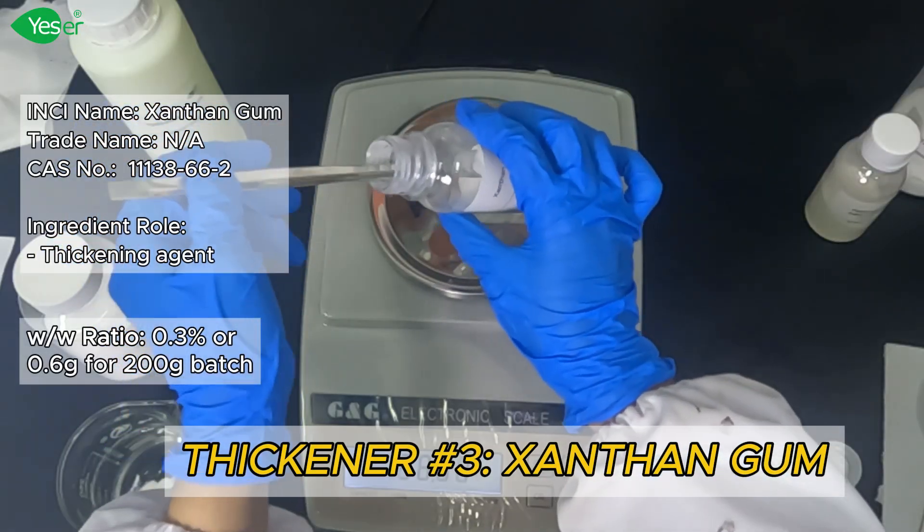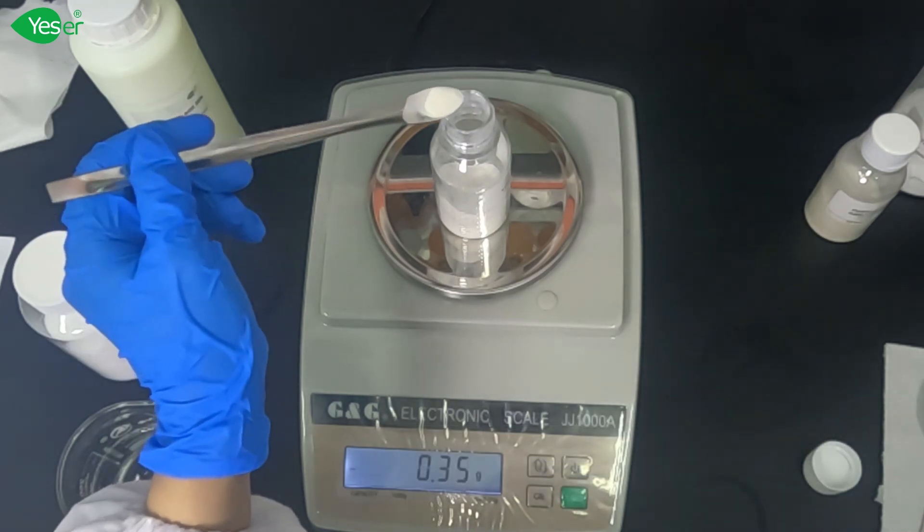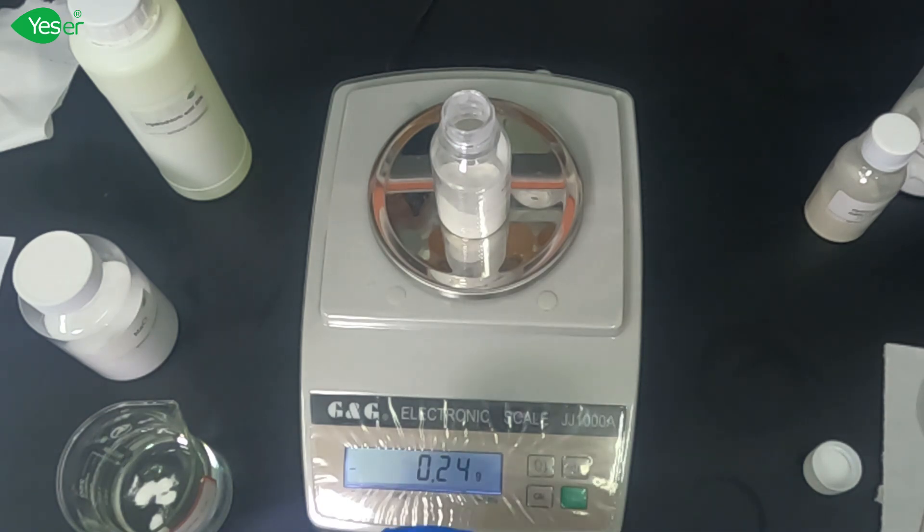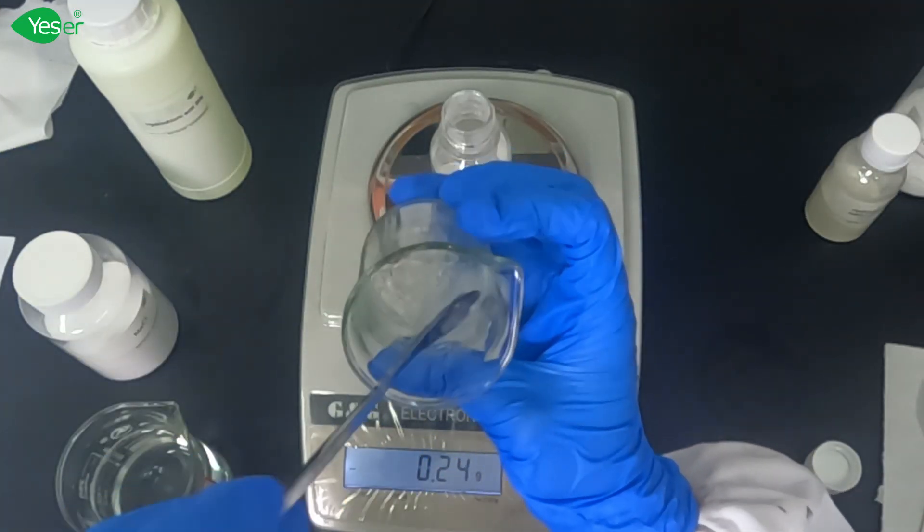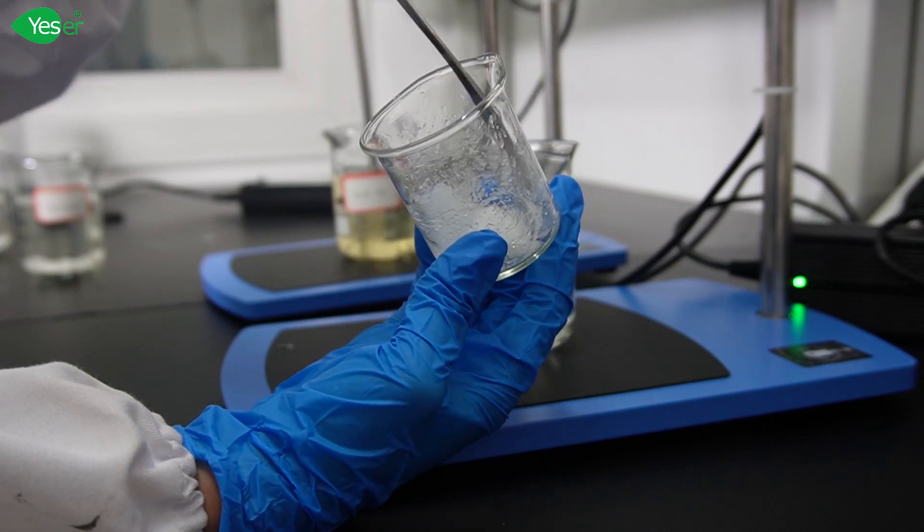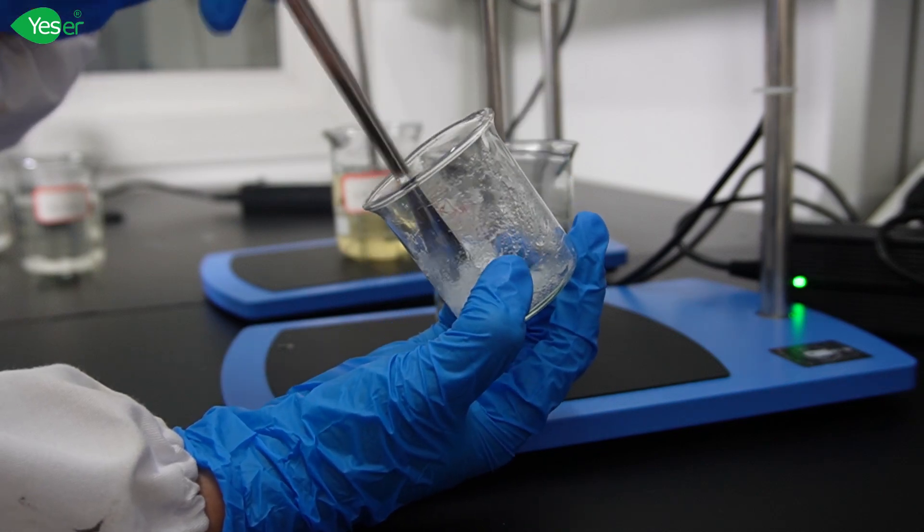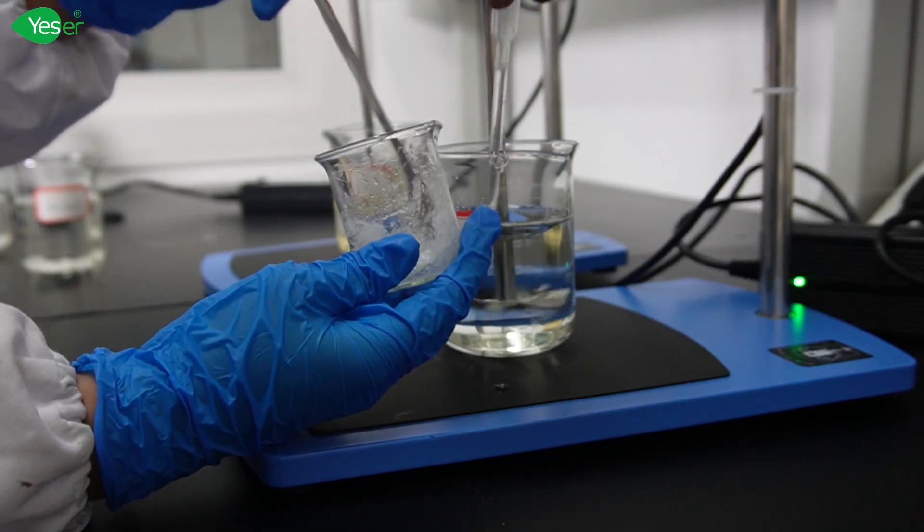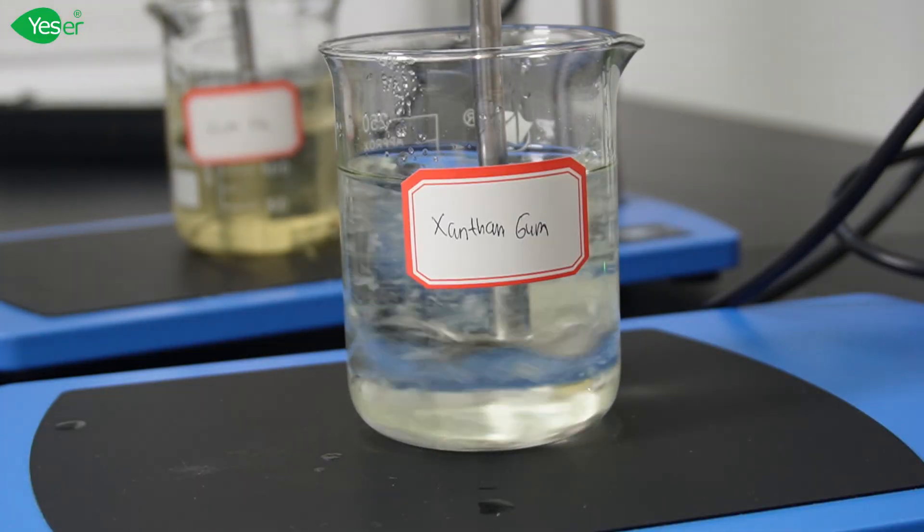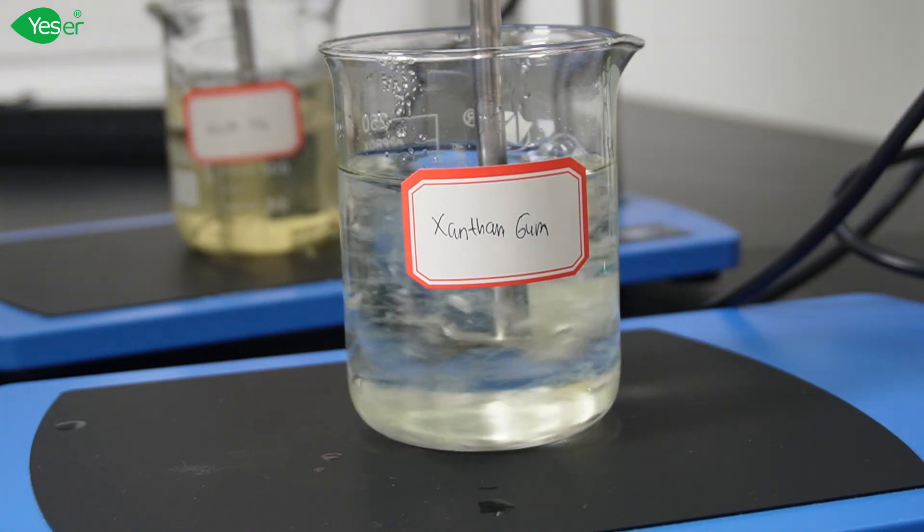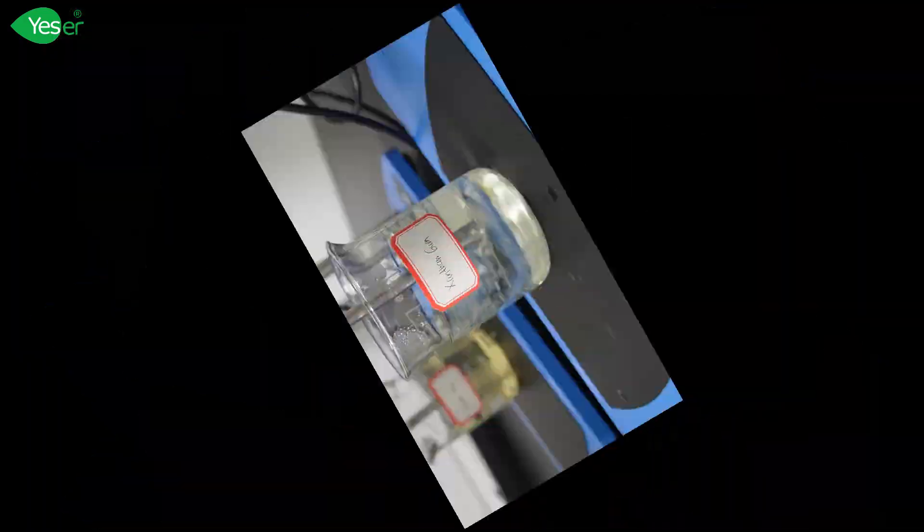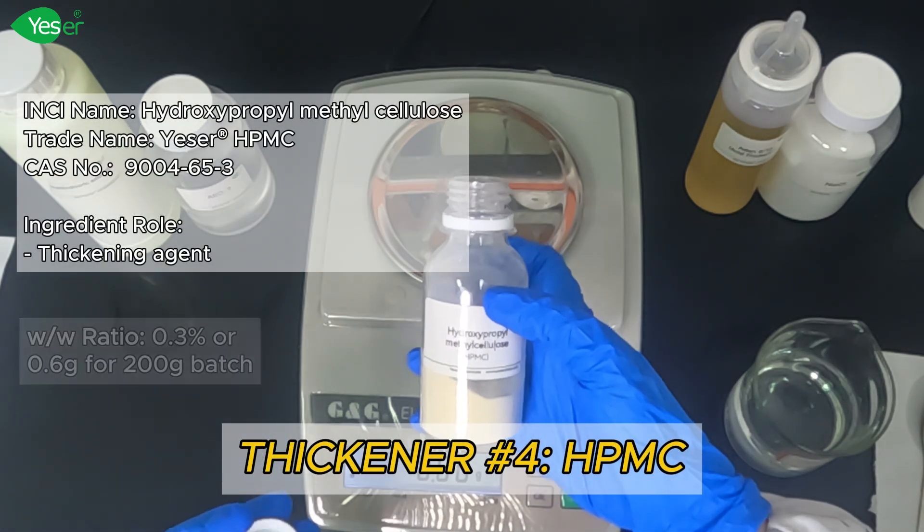Next is our xanthan gum. Let's add 0.3% in our formulation. We need to fully disperse the xanthan gum with a small amount of water before adding it to our acidic solution. While we are stirring the xanthan gum in the solution, we're going to hydrate HPMC, our next thickener, for our last batch. Weigh 0.6 grams of HPMC.